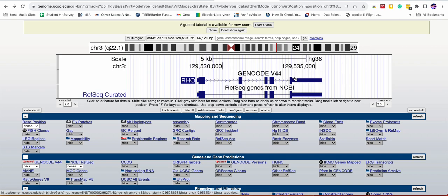And many genes have a rather long section of 3' non-coding sequence. There might be control and trafficking signals in there that are used by the cell. There's a sequence in there that tells an enzyme system to put a poly-A tail on the end of this. And so these things exist. But here's the structure of a gene. I got 1, 2, 3, 4, 5 exons.